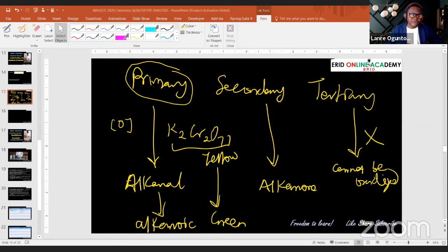Who wants to do that for us? Oxidation of alcohol. Yes, I'm listening. We want to take an oxidation test for our sample C. Anyone explaining that? Or you can send it in the chat section, in case you have issues with your audio. I can take it from the chat session.